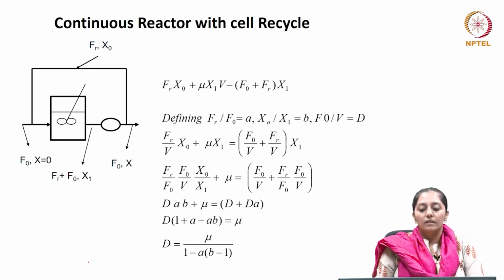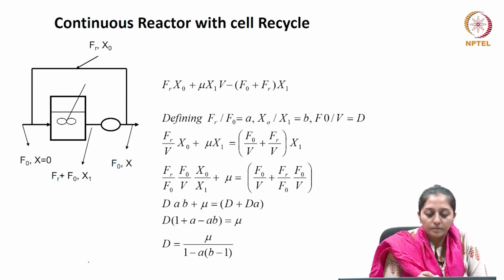So, let us design a continuous reactor with cell recycle. Please note the schematic shown on the slide.